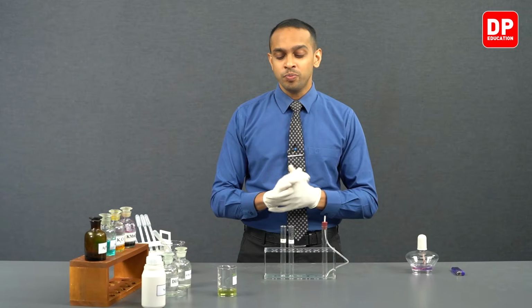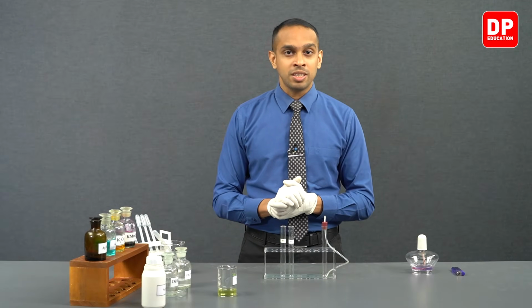And then we will see how silver 1+ ions react with sulfide ions. As silver 1+ ions come into contact with sulfide ions, you will observe the formation of a black color precipitate. This is again because silver sulfide that is getting formed is a water insoluble black color precipitate. So now let's observe these reactions.